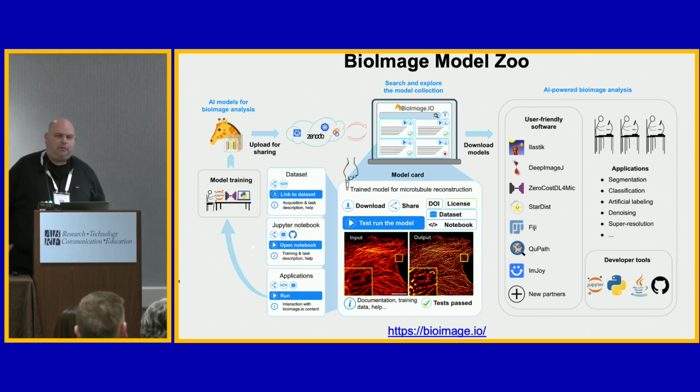So I very quickly went through all these different things, and you're like, well, that's a lot. And some of these seem to be similar. So it is true that all of them can do 2D segmentation in some ways, but they all have different benefits. Some are stronger in 3D, some are stronger in GPU support, some are stronger on the cloud. So there are all different options, and the best way to navigate these is to ask for help.